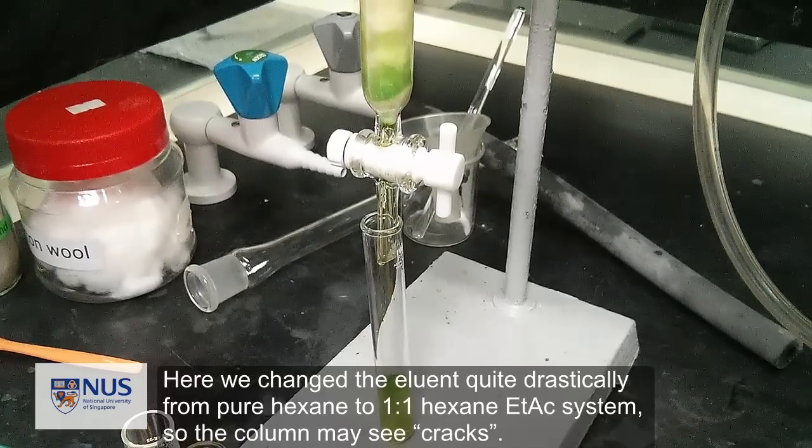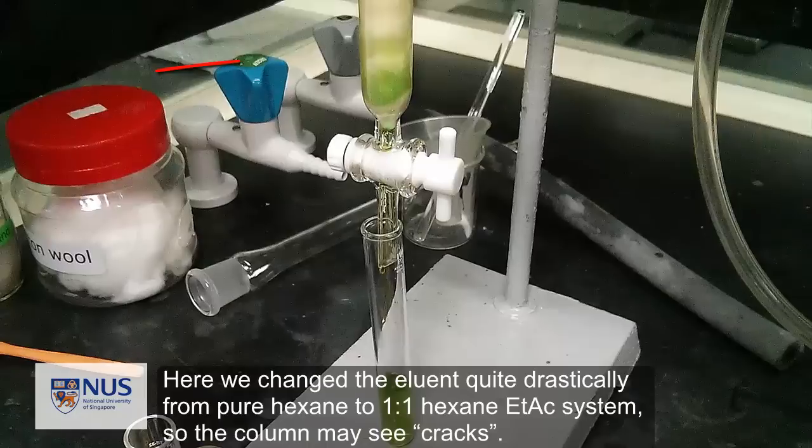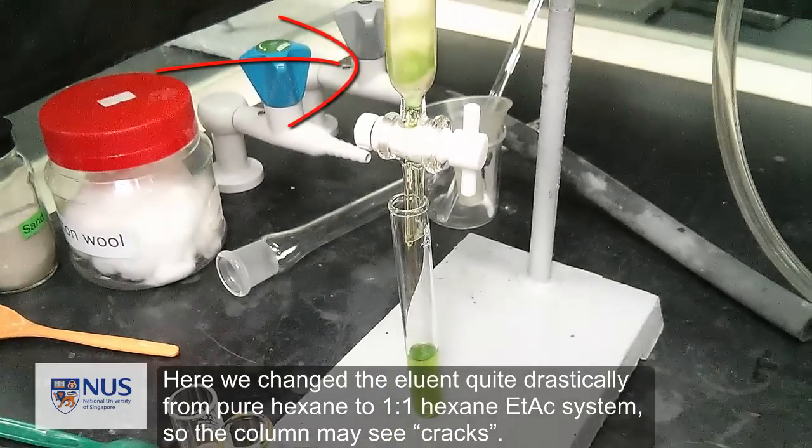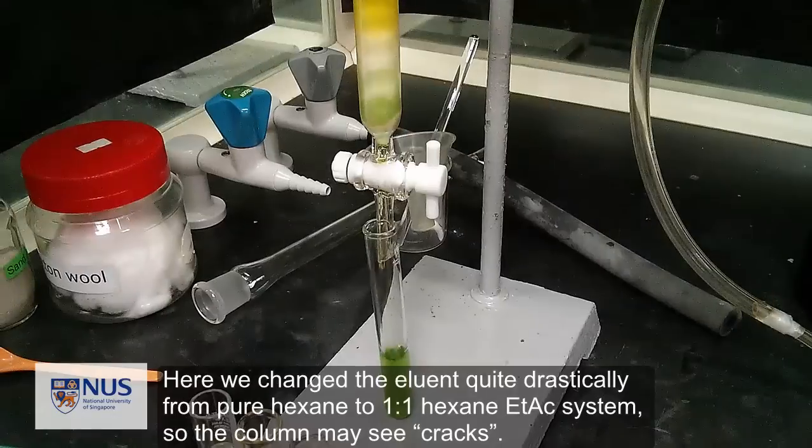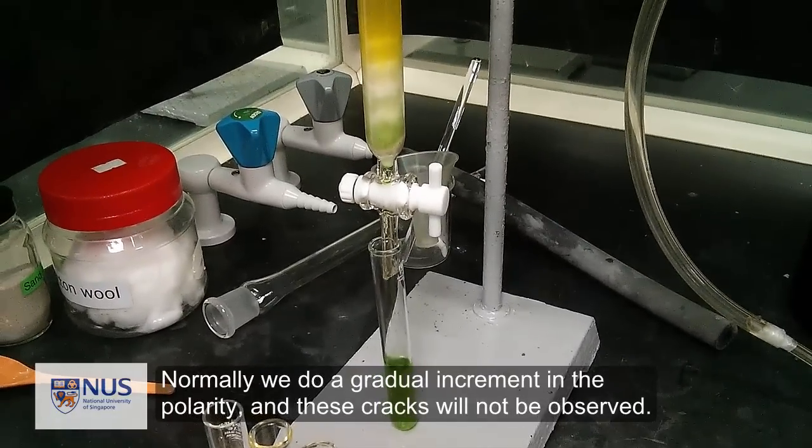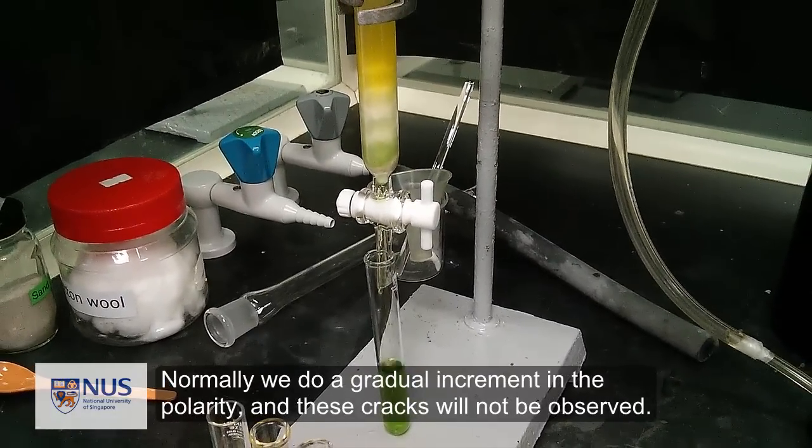Here we change the eluent quite drastically from pure hexane to a 1-to-1 hexane ethyl acetate system, so the column may see some cracks. Normally we do a gradual increment in the polarity, so these cracks should not be observed.